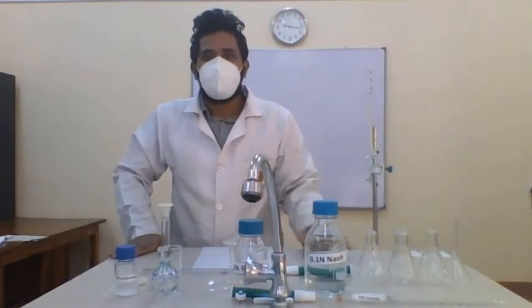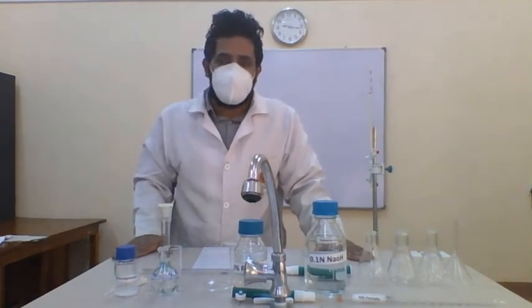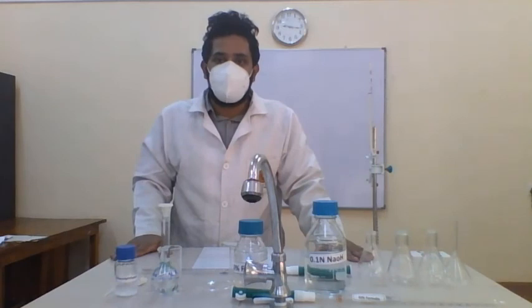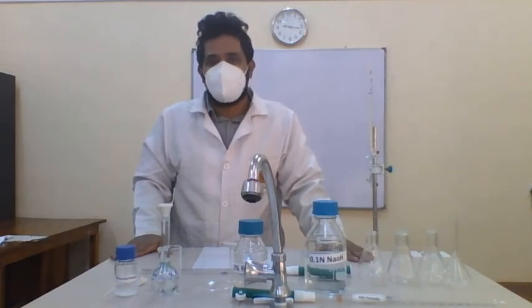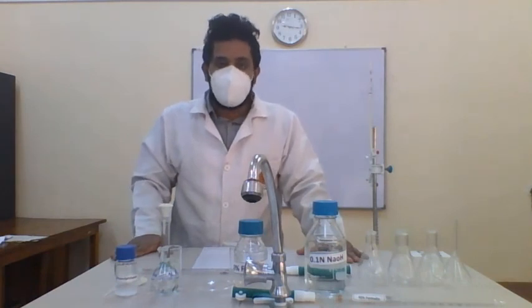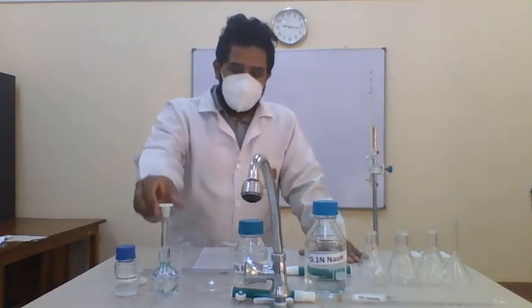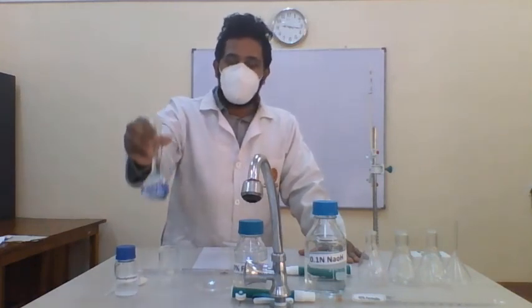This experiment is to determine the percentage of amino acid in a given solution. This is called the Sorensen's formol titration. According to the procedure, first of all, we have prepared the amino acid solution. We have already prepared the amino acid solution.